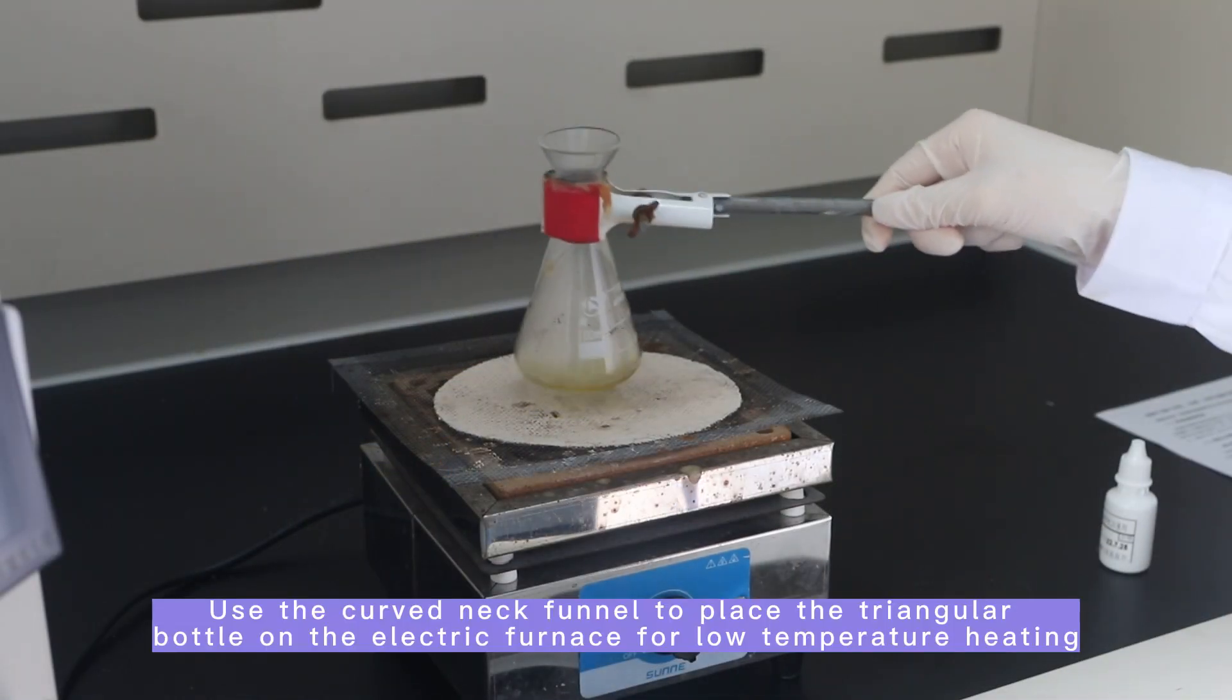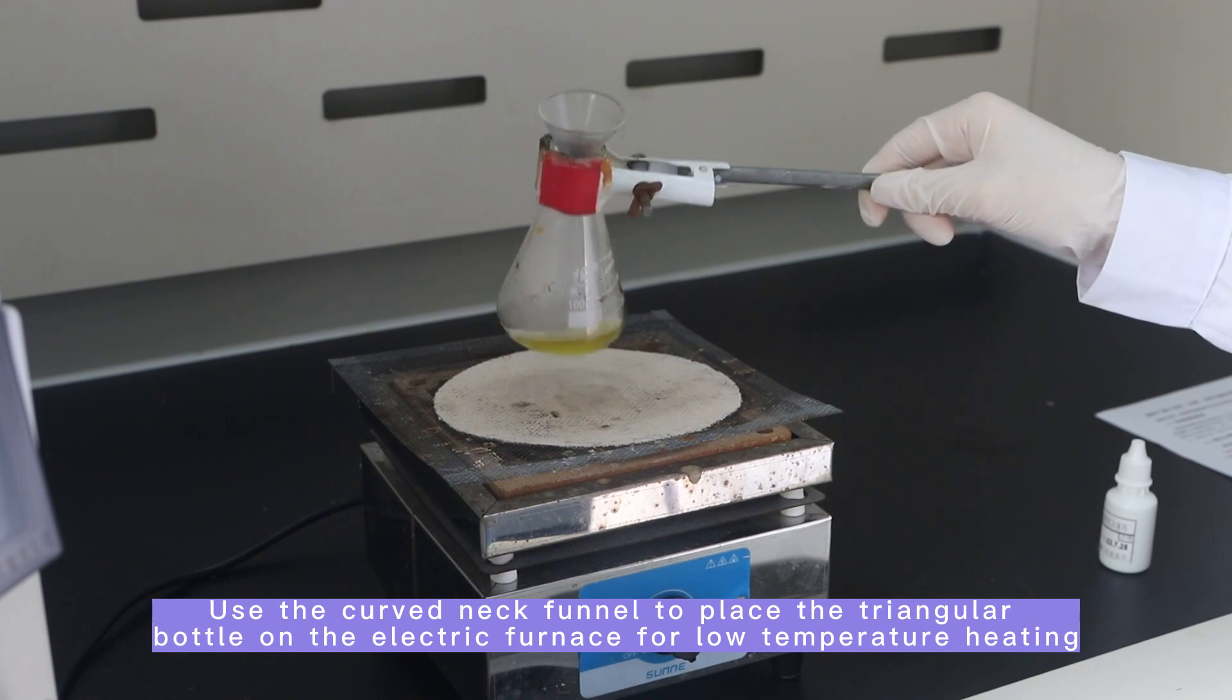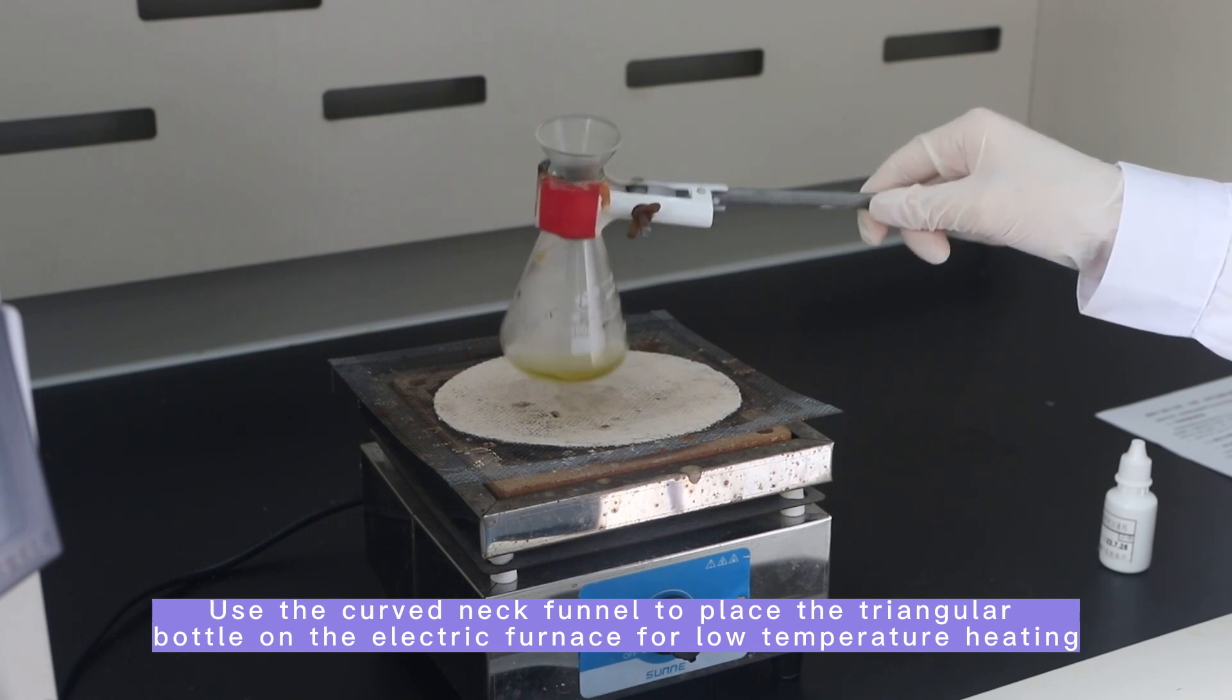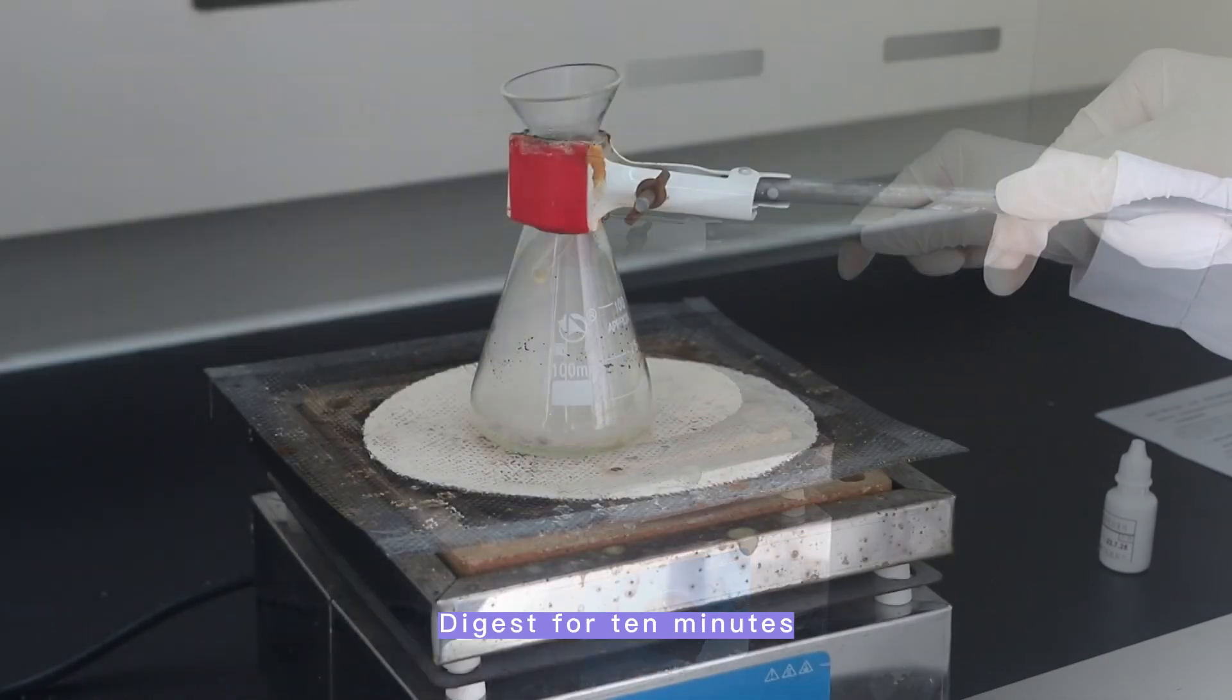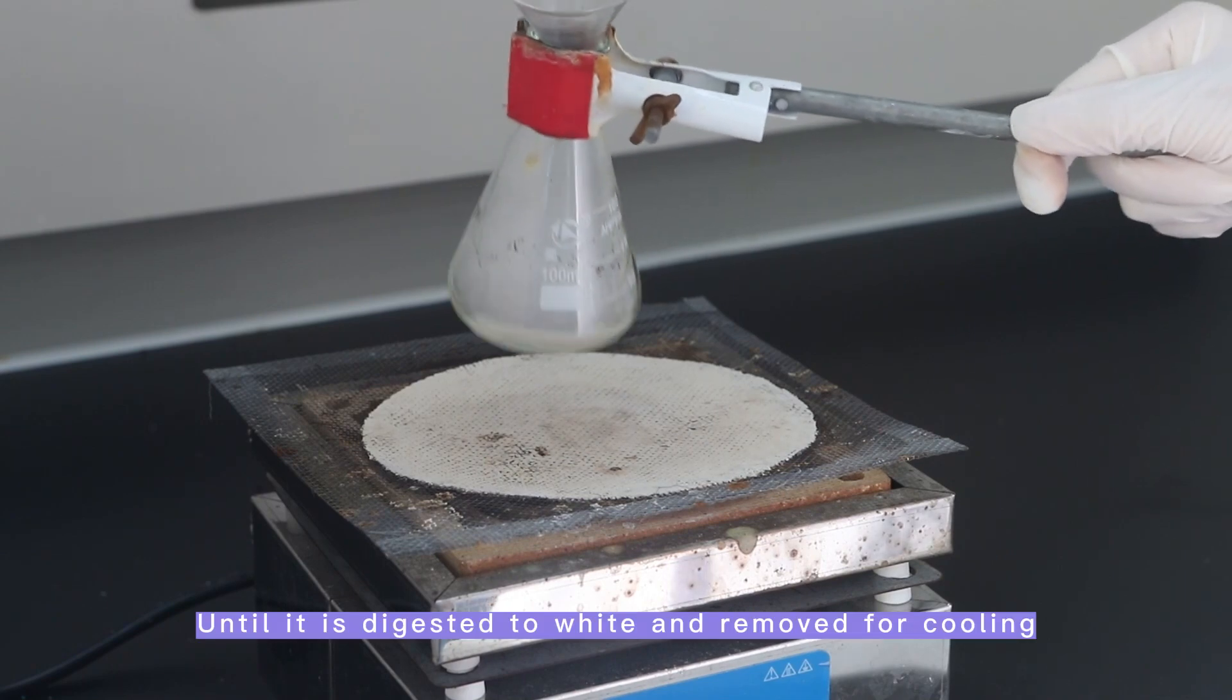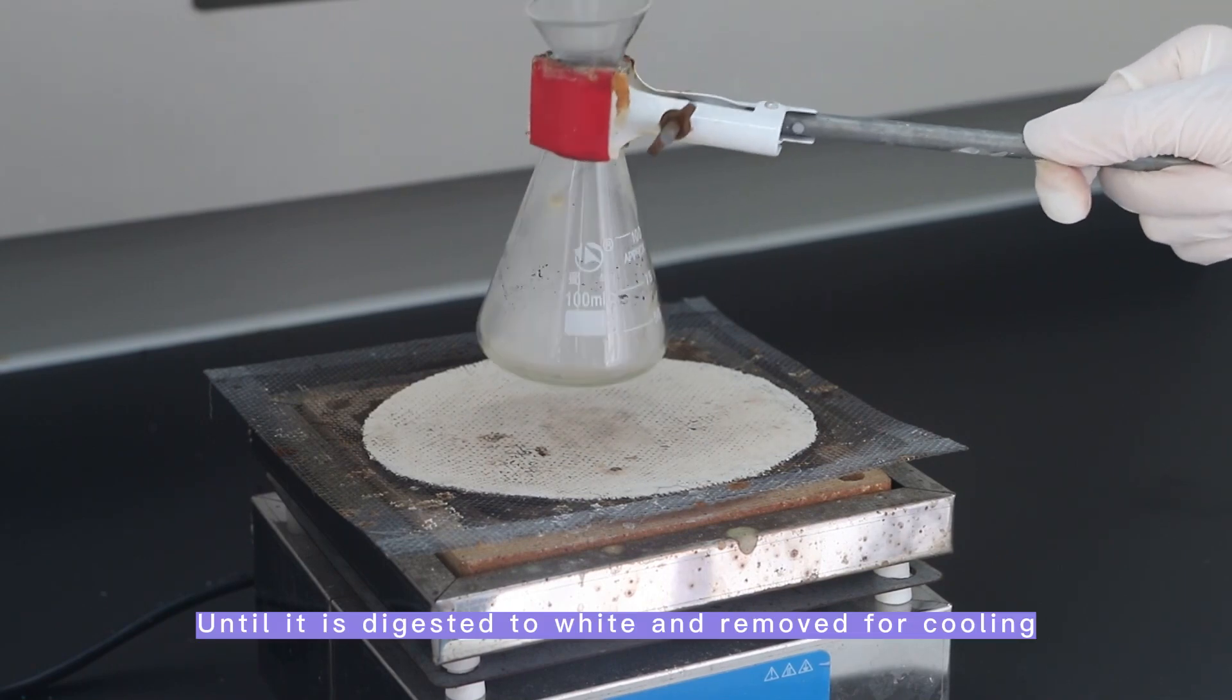Use the curved neck funnel to place the triangular bottle on the electric furnace for low temperature heating. Digest for 10 minutes until it is digested to white and removed for cooling.